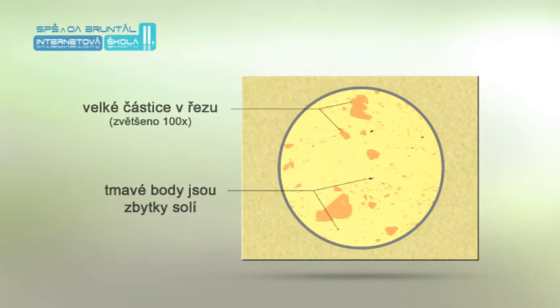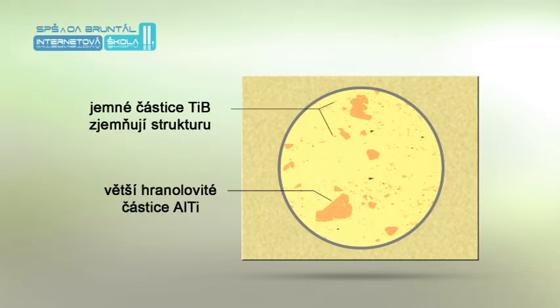In this image we see boride inclusions, which enter the melt most often in the melting furnace during grain refinement either with blocks containing titanium boride or with wire containing aluminum, titanium and boron in the casting trough.